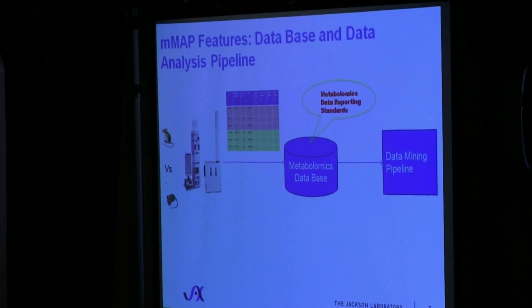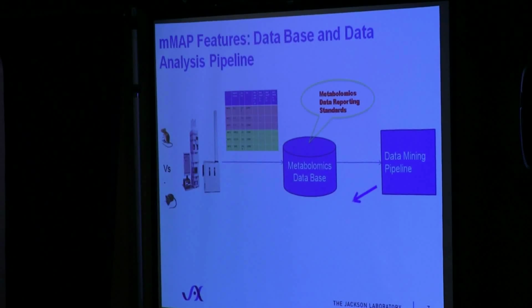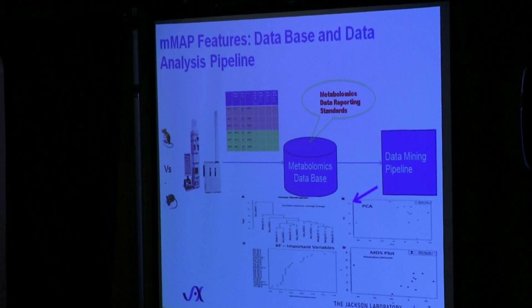And then I created this data mining pipeline. What this data mining pipeline does is it creates publication quality graphs with a click of a button, so you don't have to actually write any scripts or anything. And I'll go over in detail and show you how it works.